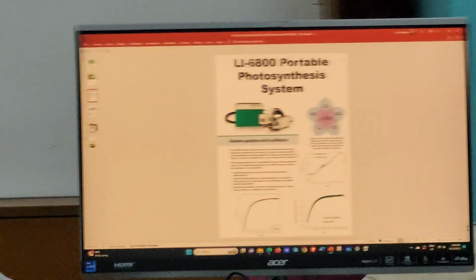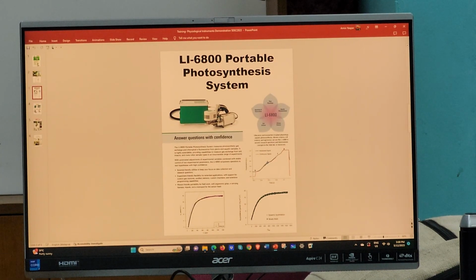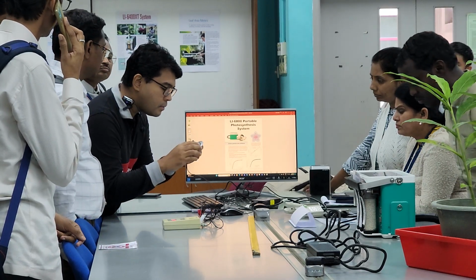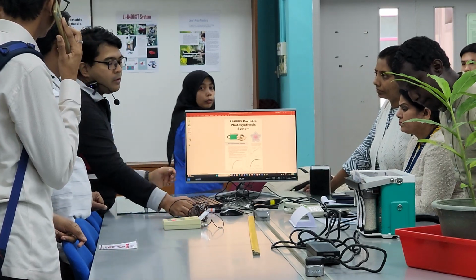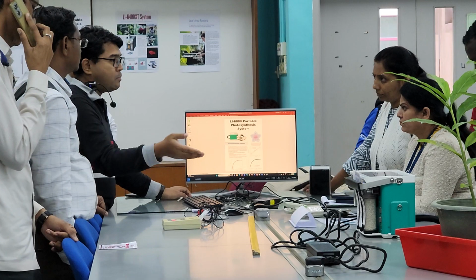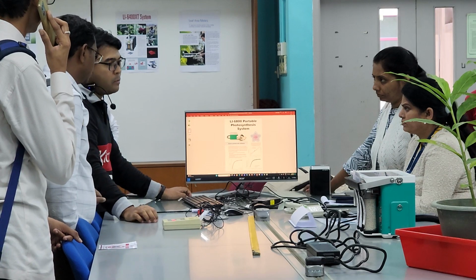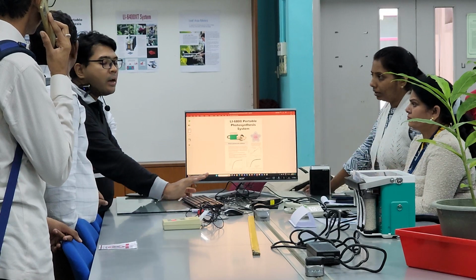Next, what do we have? We need to calibrate it. From time to time, we send it back to the manufacturer to calibrate it in a controlled environment. One good thing about this is that it's waterproof, so you can leave it outside. You see by the side here, the water can actually go through it, there's a hole. But when you leave it outside, you get all the dust, the debris, and so on, which could tamper with the precision of the equipment. So from time to time, send it for calibration, and everything should be all right. It lasts a very long time.